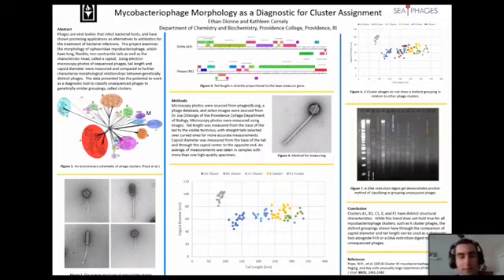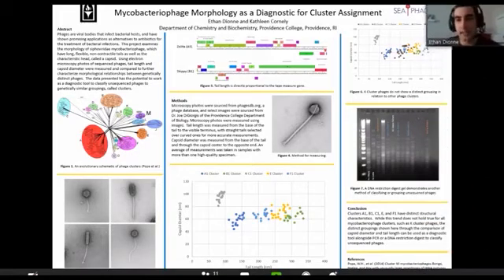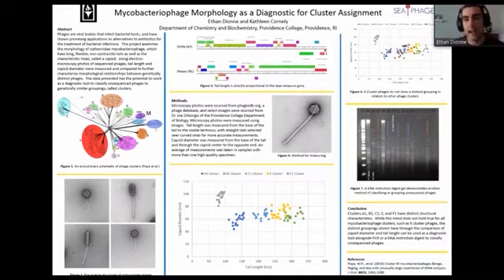I'll try to keep some of the context for my presentation short since they covered a lot of it already. But my project is one that I took up after we left PC and started our social distancing from home. I did a bioinformatics project that involved measuring microscopy photos of Mycobacteriophage in hope that we could discover morphological characteristics that could serve as a diagnostic for cluster assignment.